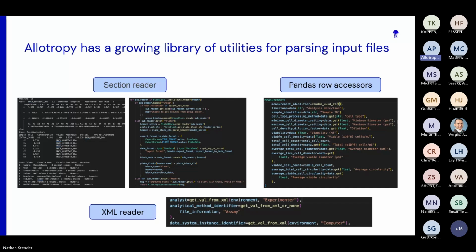And also, if there are some columns that just don't fit in the ASM ontology mapping right now, you can automatically dump all that data to the custom info document to ensure that you're not missing any of the instrument data.